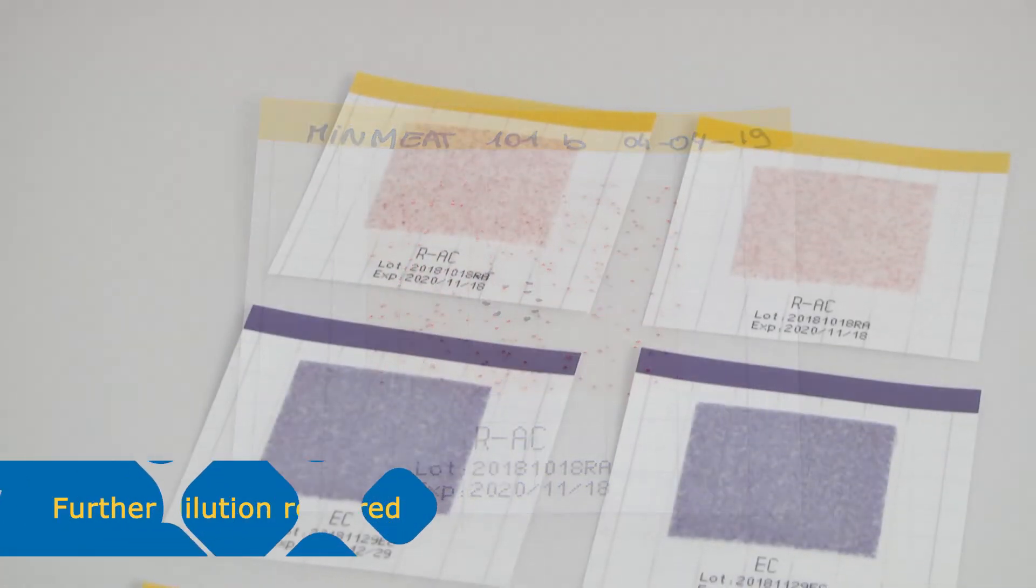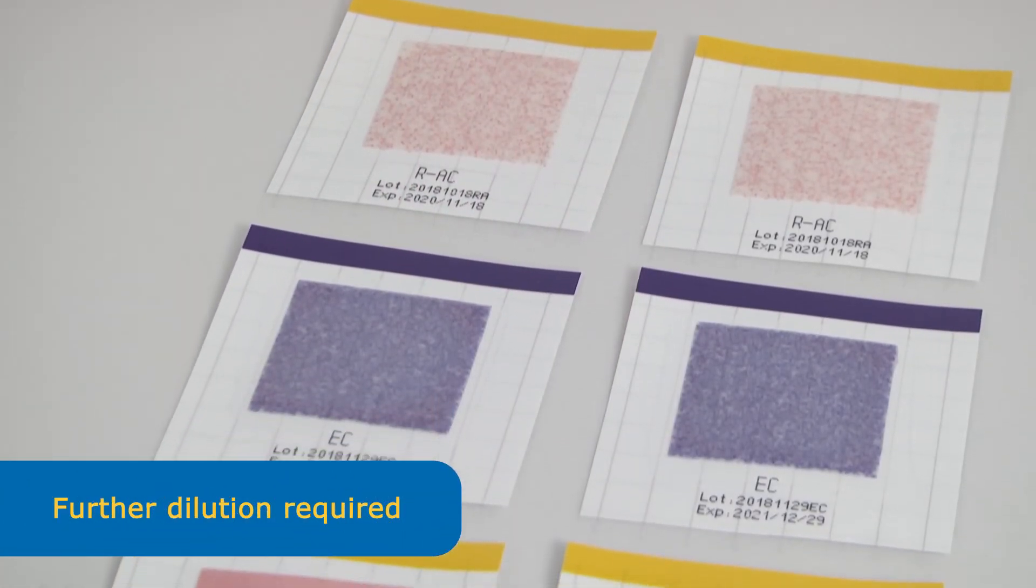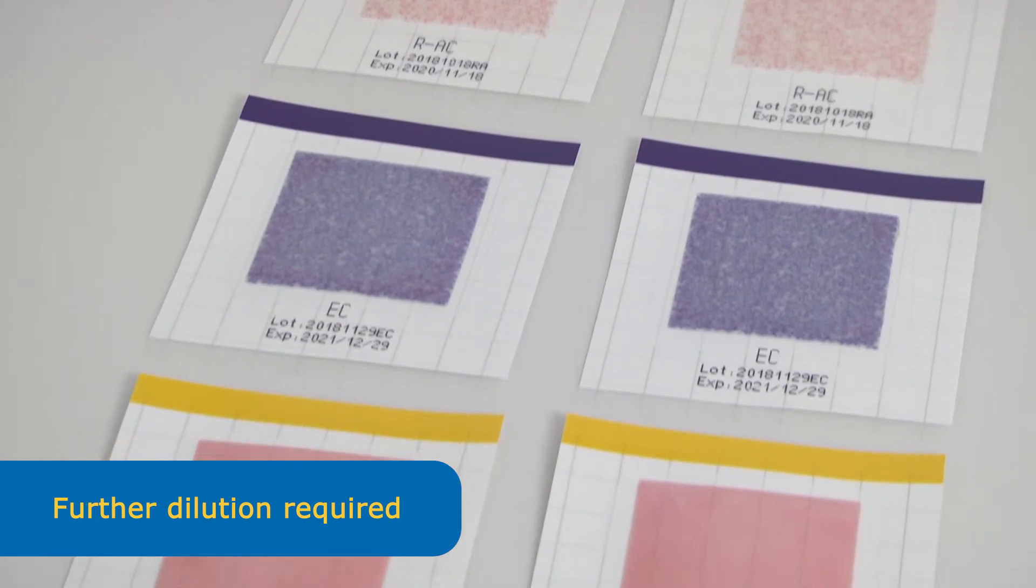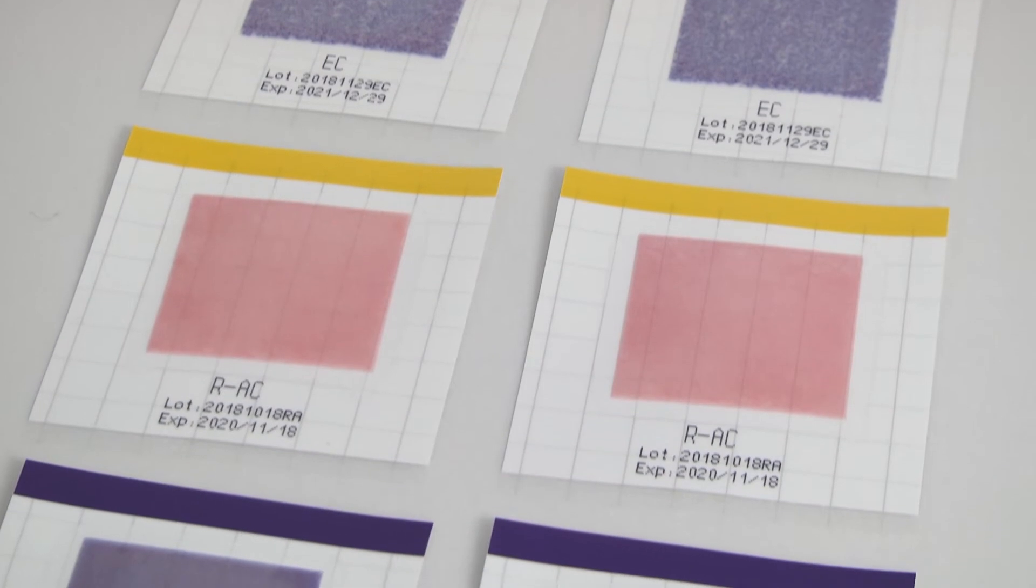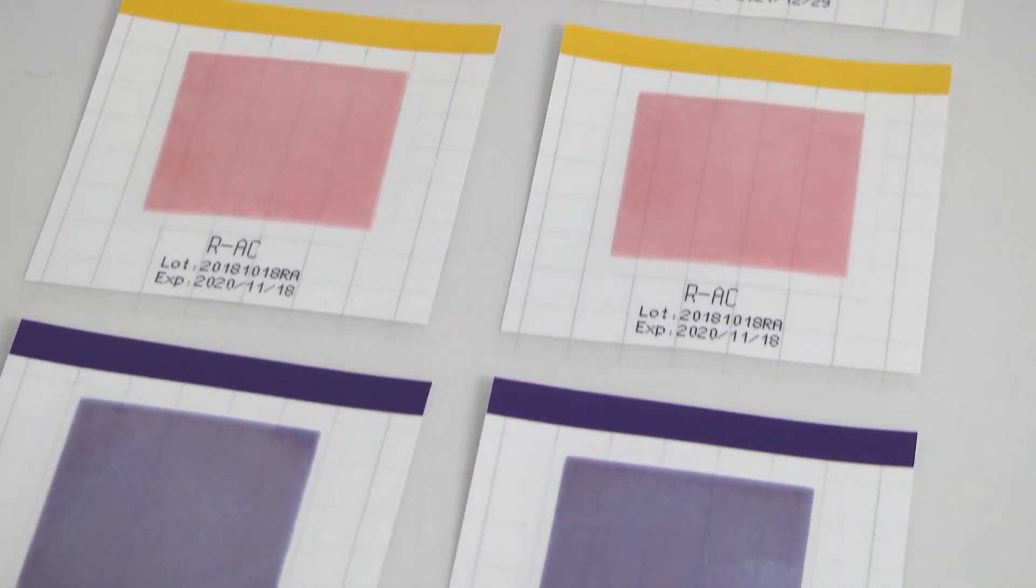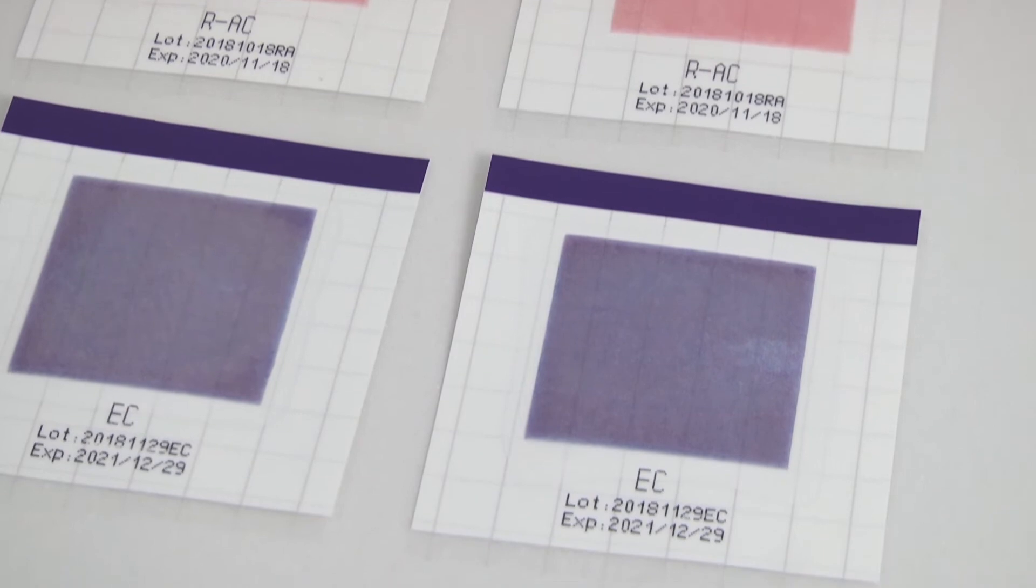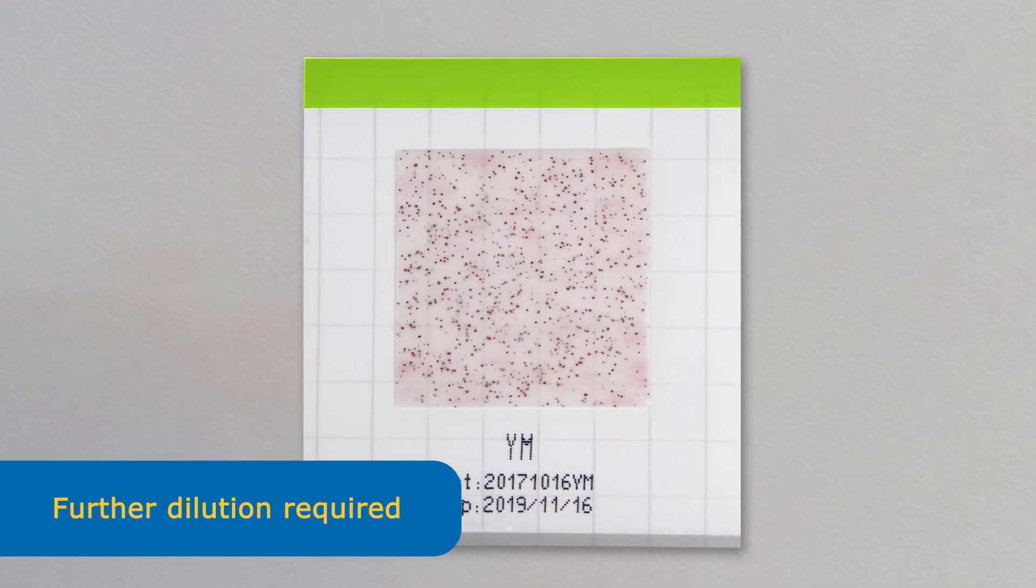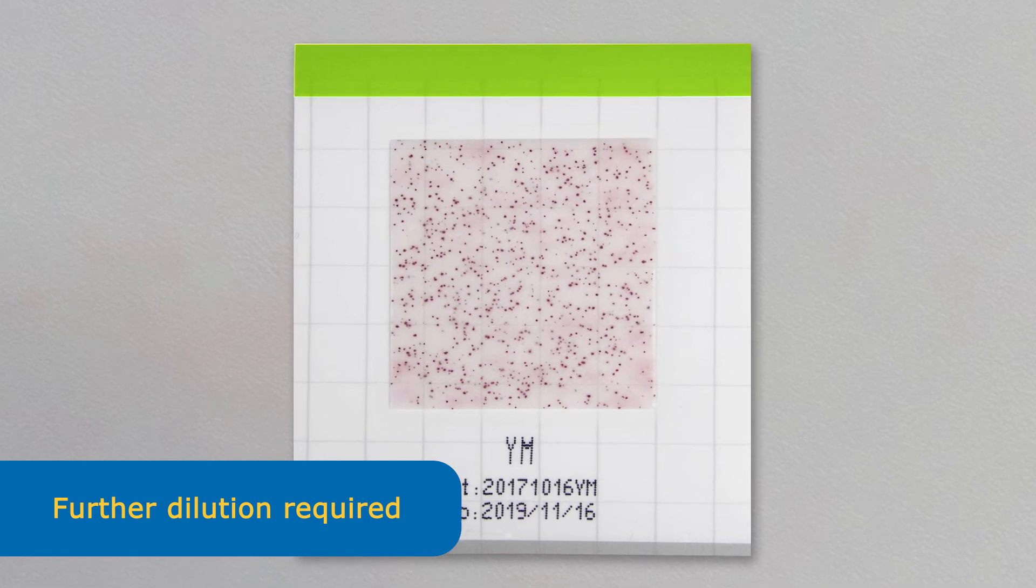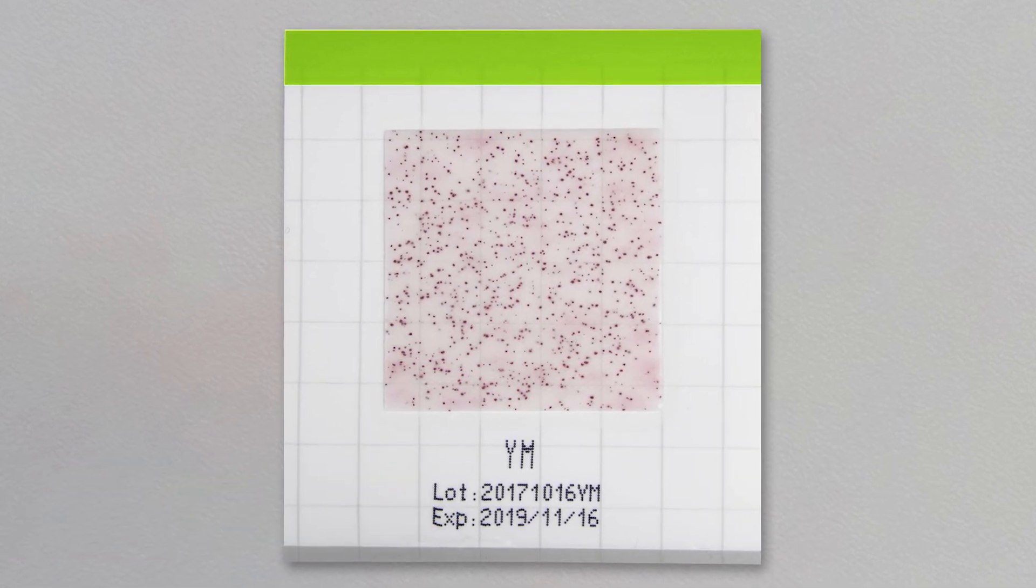If more than 400 CFU are grown, the entire pad may appear stained. In general, if more than 300 CFU are grown, the sample should be diluted further and retested. For yeast and mold, further dilution and retesting may be required at 200 CFU.